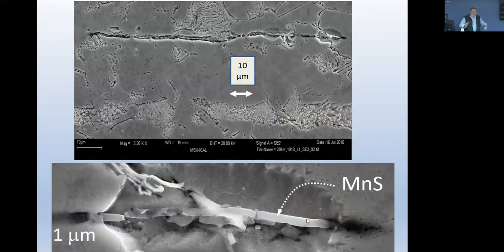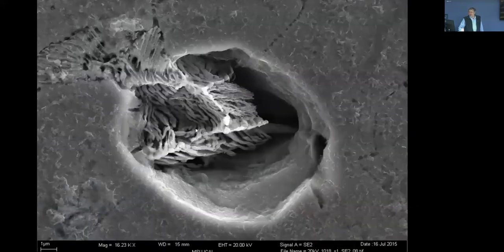But it was held together by the carbon steel matrix. So as soon as the material was released, it snapped and cracked here and here, because suddenly it felt liberated, and then released the stress by simple cracking here and here. This we see quite a lot. Here's the last example.